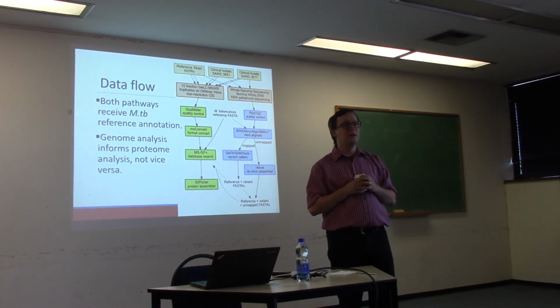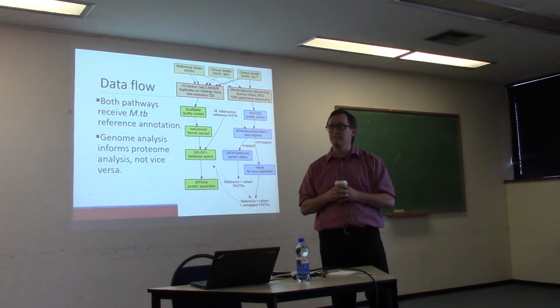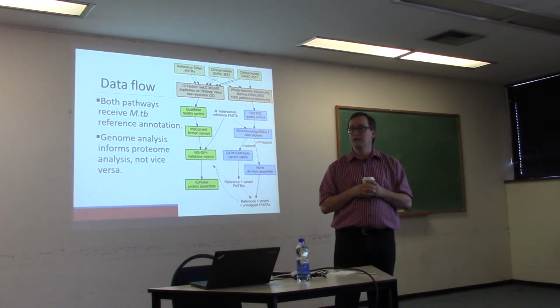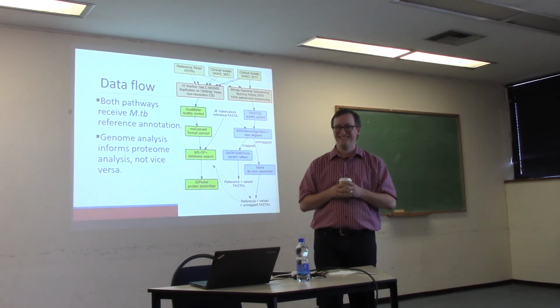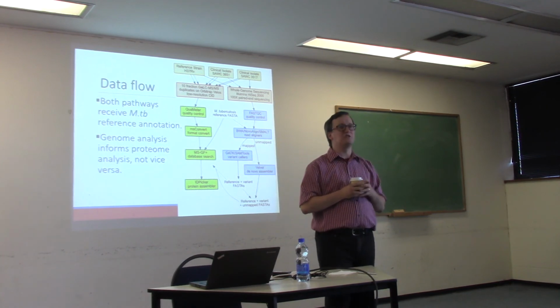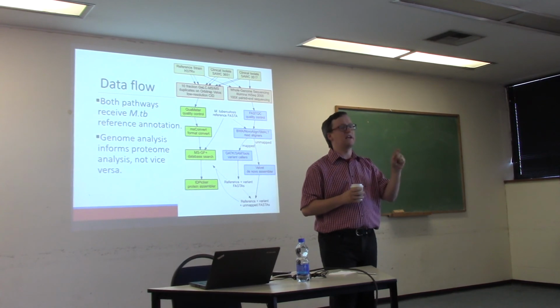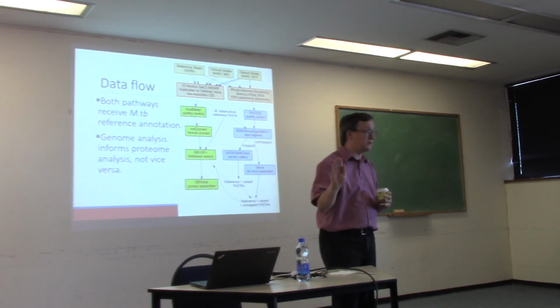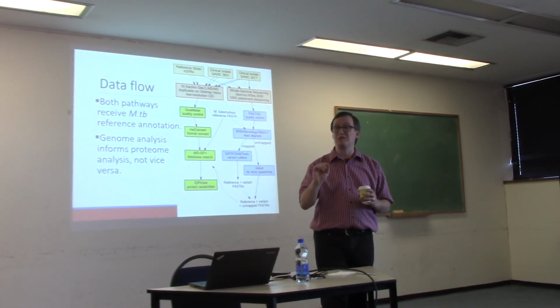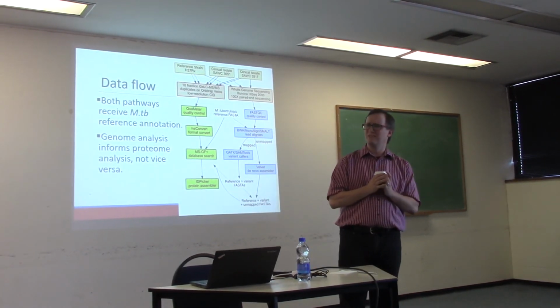So how frequently do we have spectra that we fail to identify? And the answer is every experiment. Every experiment, a huge swath of it. This is what a lot of people in my field have taken to calling dark matter. So one of the questions you might ask of anyone doing a proteomics experiment is, what fraction of your tandem mass spectra are confidently identified to a peptide sequence? And if they answer all of them, they clearly don't know what they're doing, because the answer is usually, best case, about 50%. So why is that?